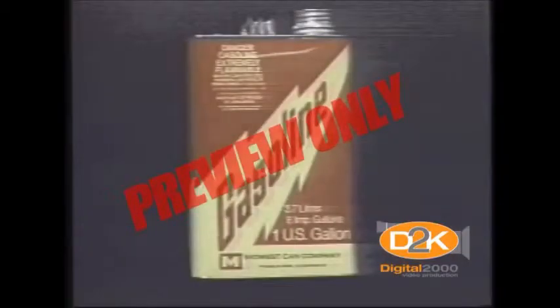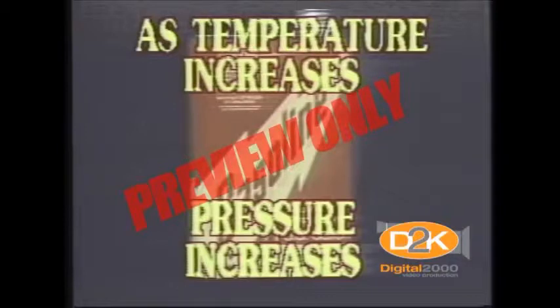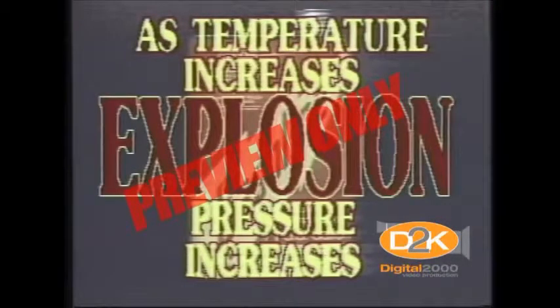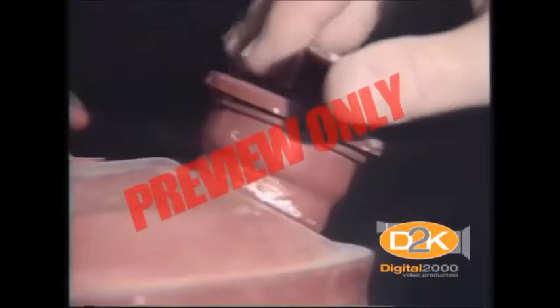The same thing happens in gasoline cans. As the temperature rises, pressure increases inside the can. If you don't release the pressure, the can may burst or spring a leak. Approved safety containers allow the pressure to escape, avoiding damage to the container.